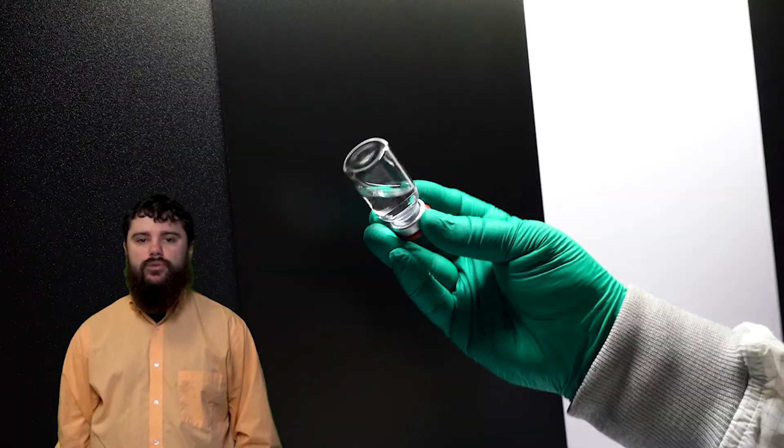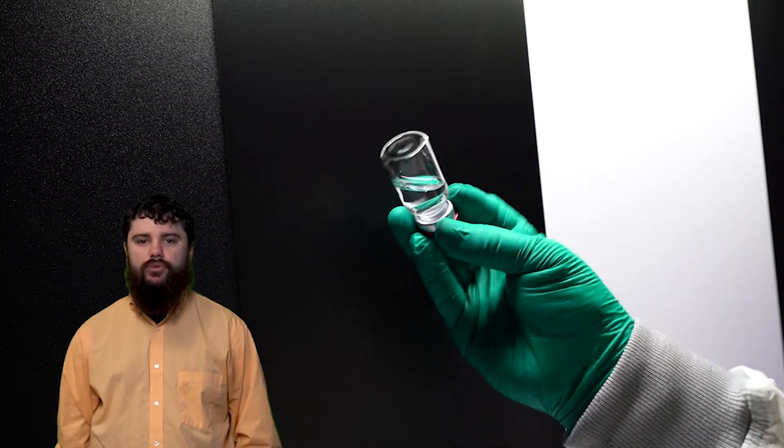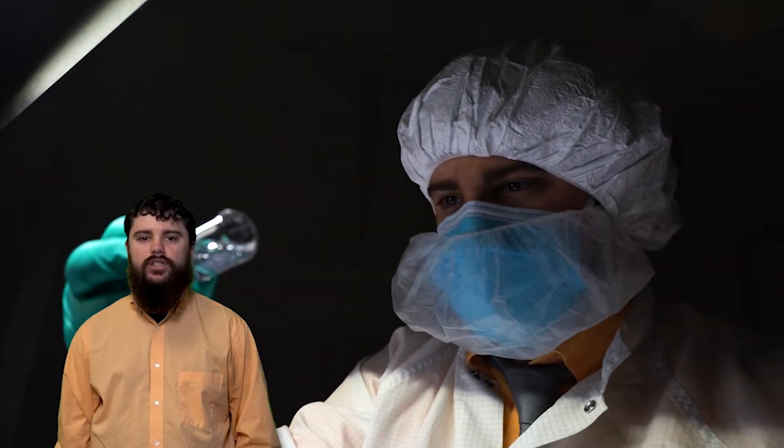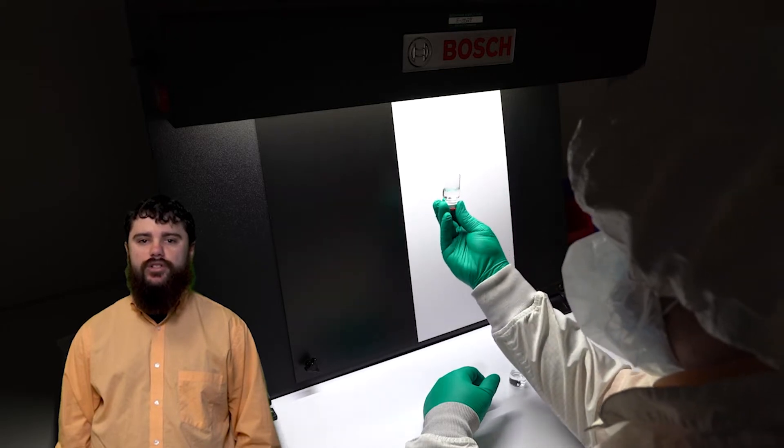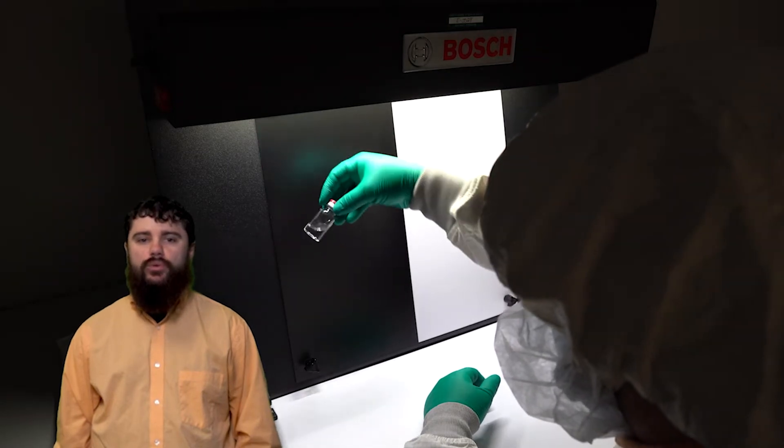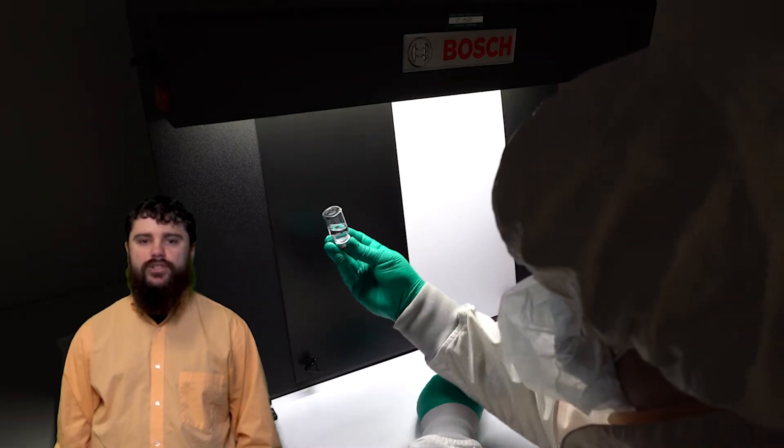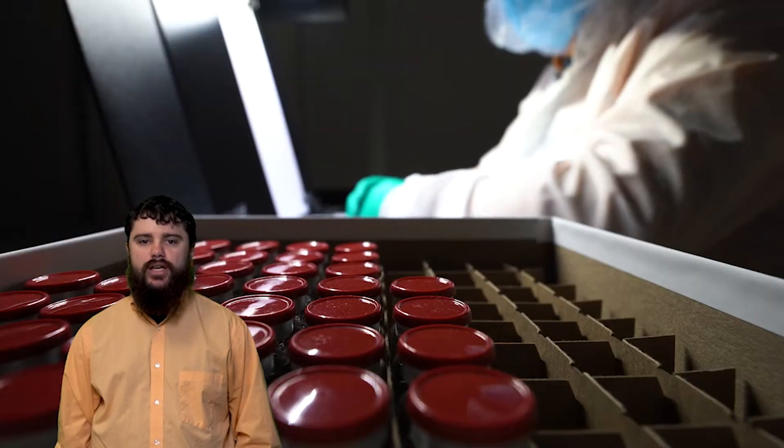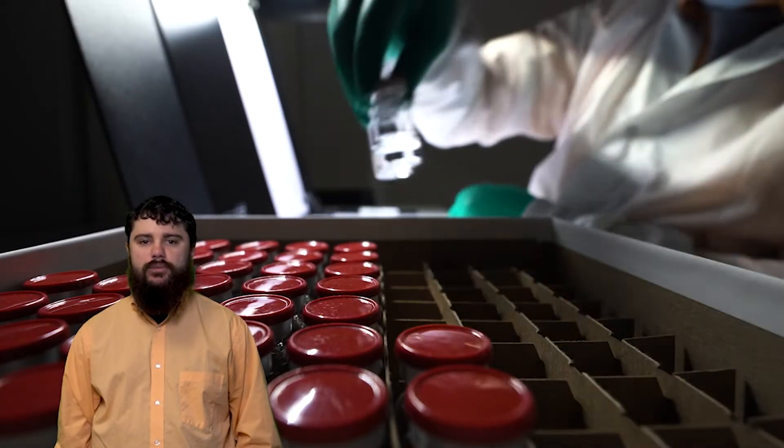Every vial, syringe, or cartridge of medicine we fill that will be released for human use must be individually inspected. To do this, we will examine each vial, syringe, or cartridge in front of a white background for five seconds, and a black background for five seconds. We will also swirl the containers to force any floating foreign material to move in the solution so we can better detect it. Each unit is examined for 10 seconds.